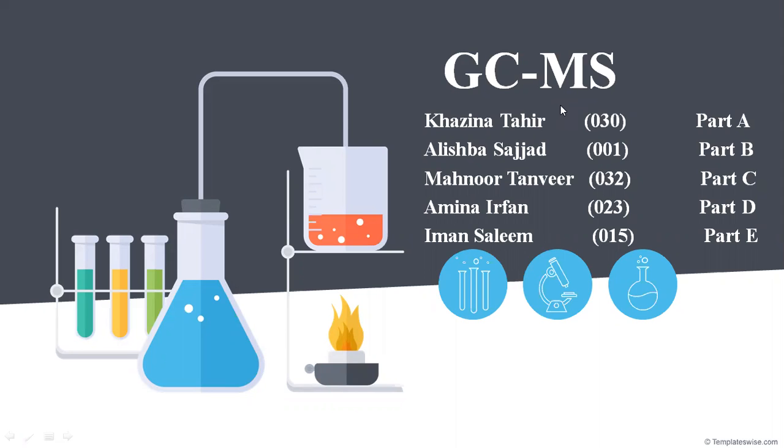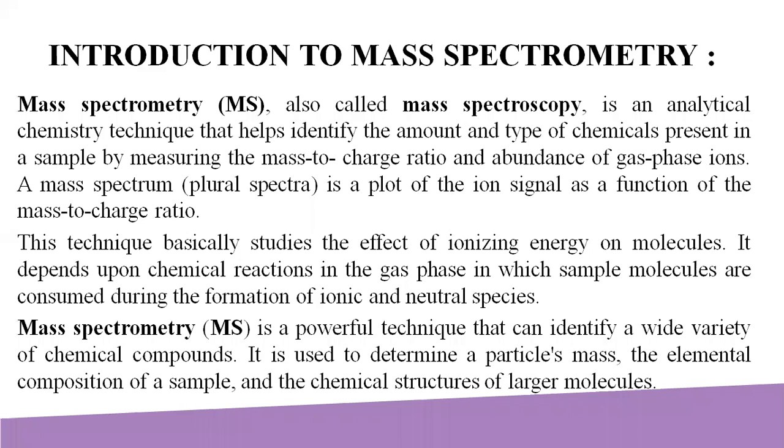First of all, what is spectroscopy? Spectroscopy refers to the study of how radiated energy and matter interact. The energy is absorbed by matter, creating an excited state. Spectrometry is the application of spectroscopy so that there are quantifiable results that can be assessed. Spectroscopy is used in physical and analytical chemistry because atoms and molecules have unique spectra.